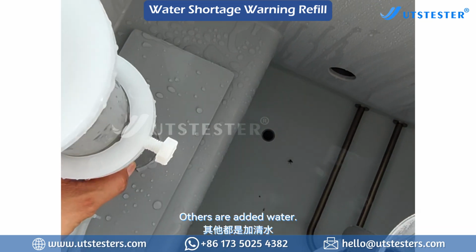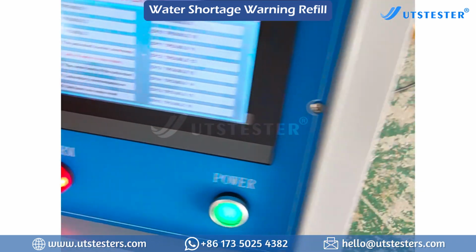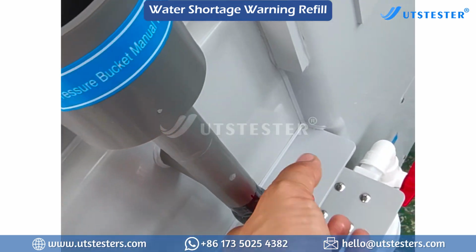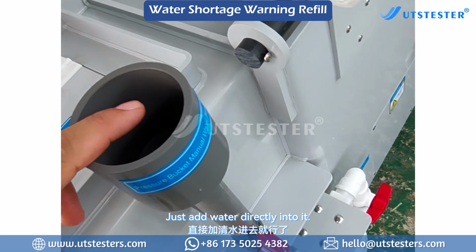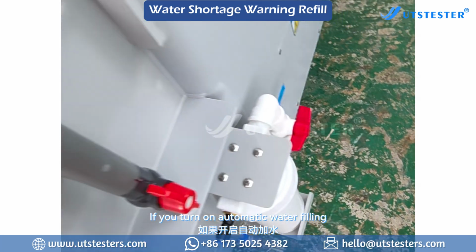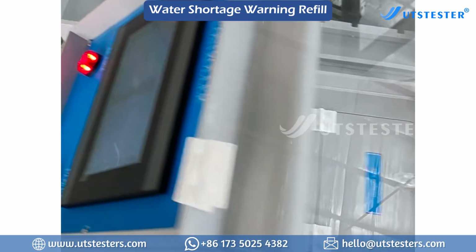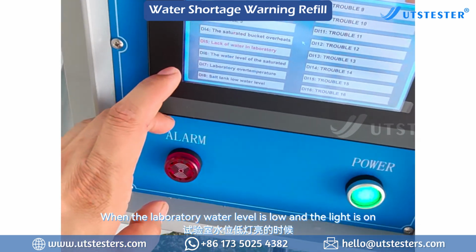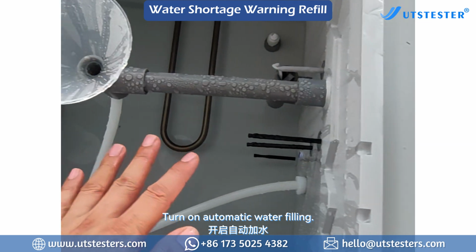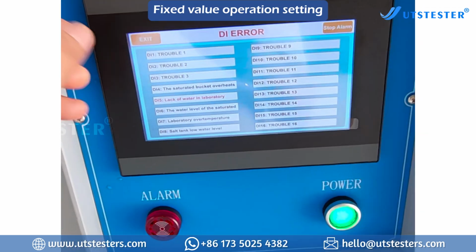Others are added water. When the pressure cylinder has a low water level alarm, just add water manually from this pressure cylinder. Open the valve and add water directly into it. If you turn on automatic water filling, you don't need to add it here. It can be added automatically. When the laboratory water level is low and the light is on, just add water from here. Turn on automatic water filling and it can also add water automatically.